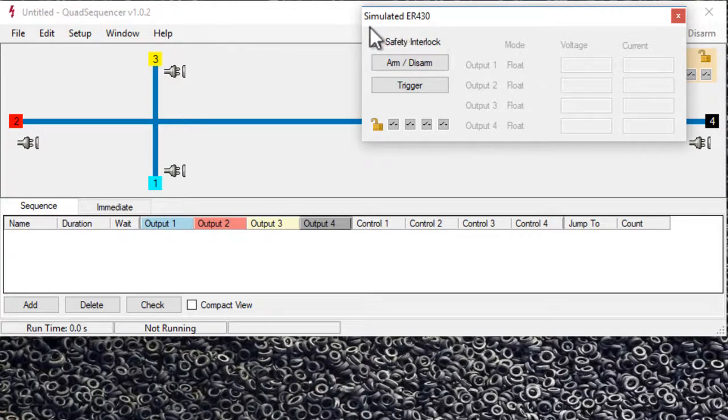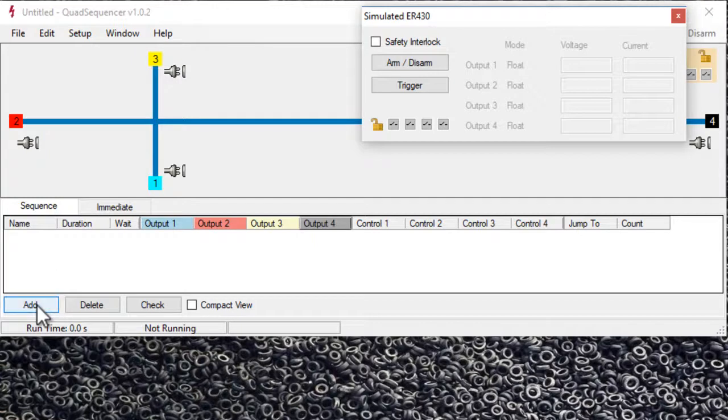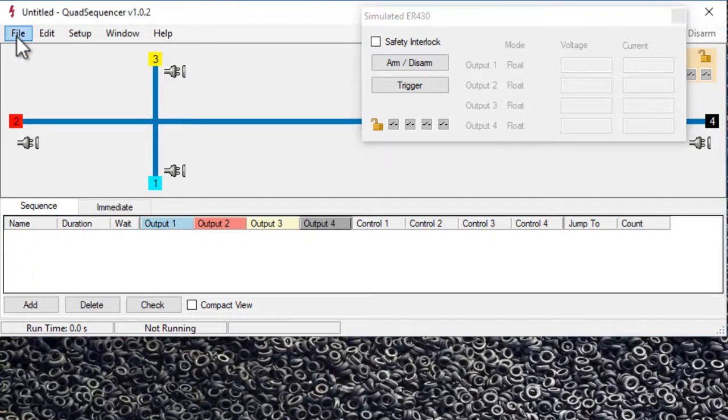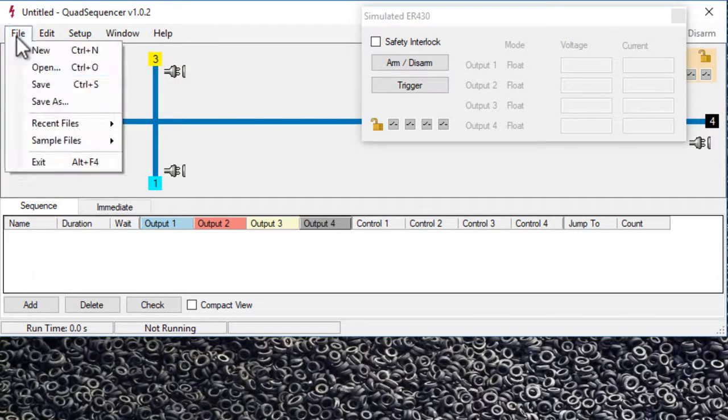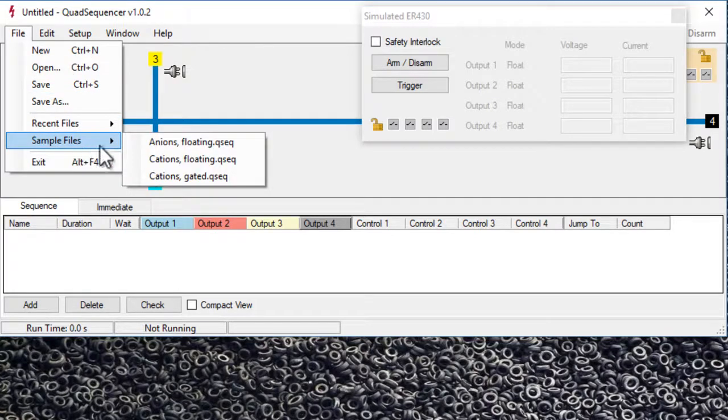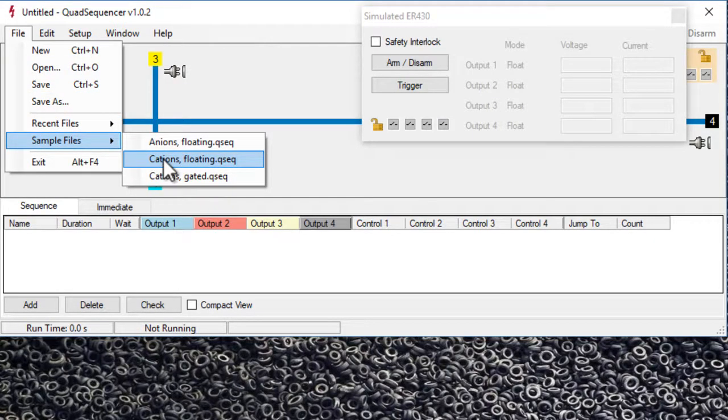You start by setting up a sequence, so you can either click add to add a sequence here, or we can use one that's already been created. In sample files we can choose the cations with floating injection.